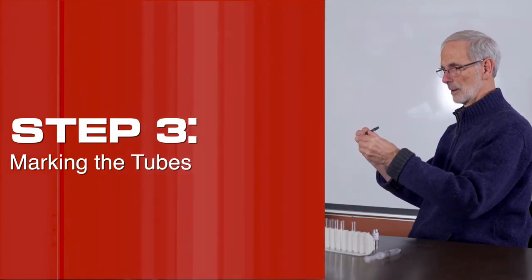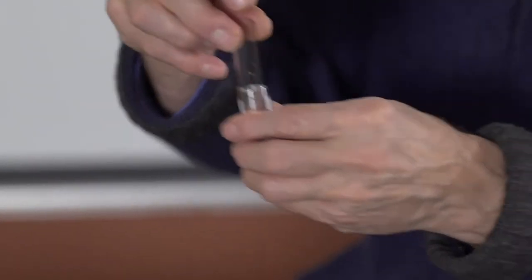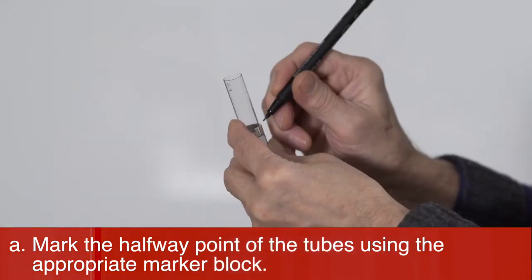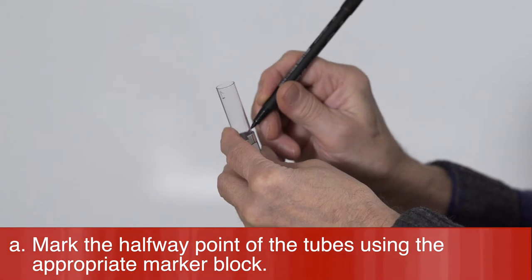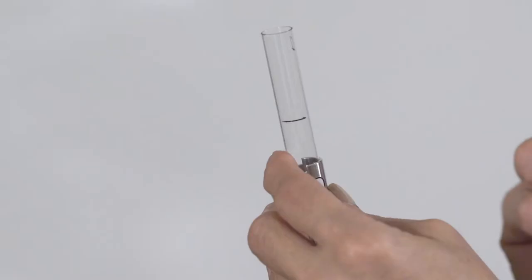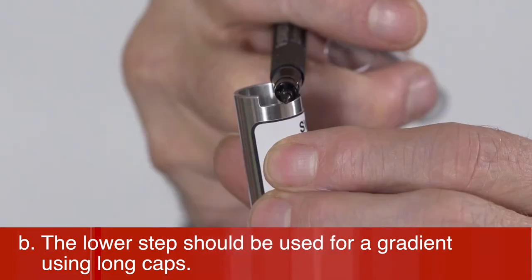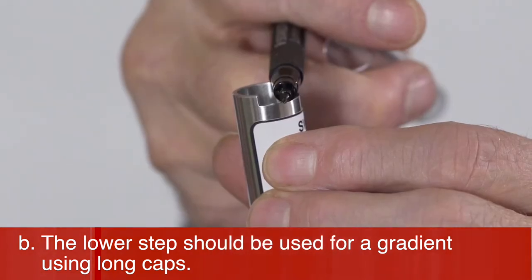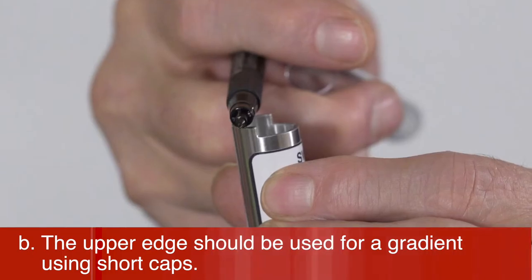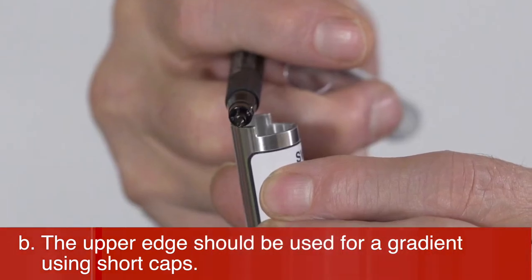Step 3: Mark the tubes. Mark the halfway point of the tubes using the appropriate marker block. The lower step should be used for a gradient using long caps, and the upper edge should be used for a gradient using short caps.